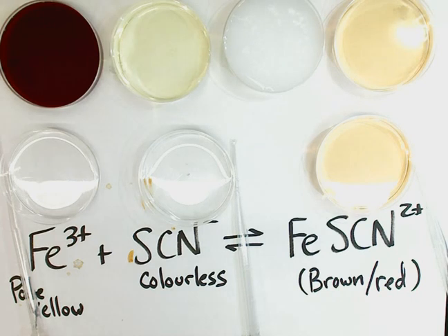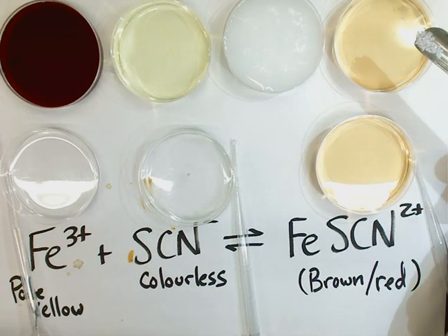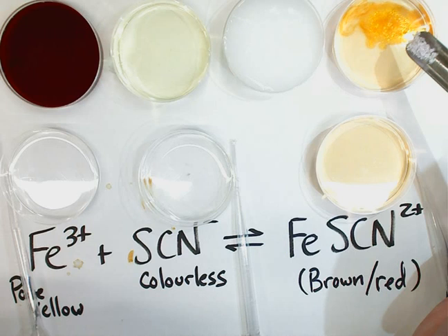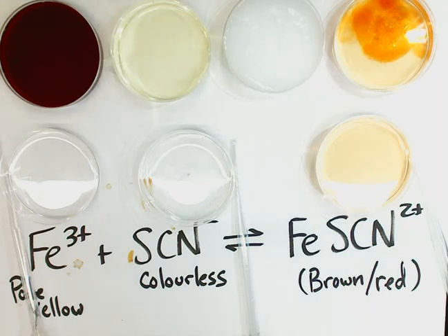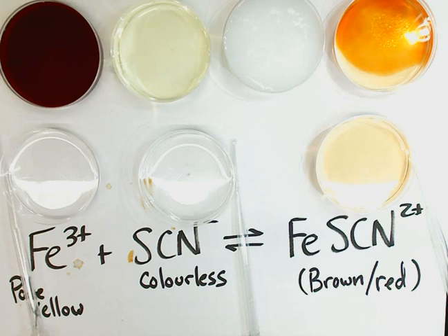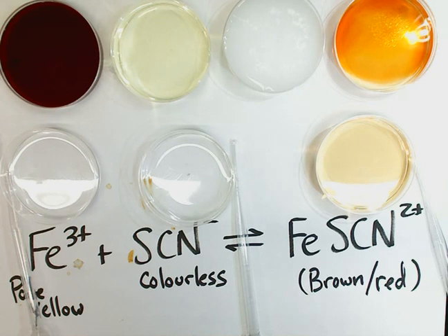We also have some solid iron 3+ here — solid iron nitrate, which contains the iron 3+ ion. When we add it directly to a system at equilibrium, we can see the reddish-brown compound becomes darker. You might think solids don't affect the position of an equilibrium — and you're right, they don't. But iron nitrate salts are very soluble in water, so as the iron nitrate dissolves, you're increasing the concentration of iron 3+, causing the equilibrium to shift forward and produce more iron thiocyanate.